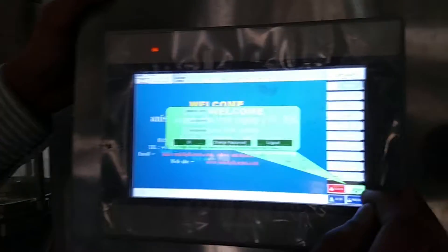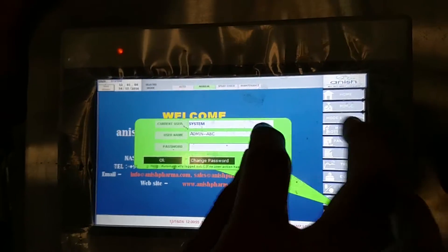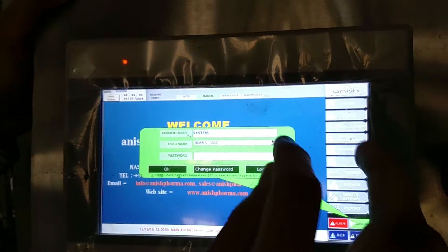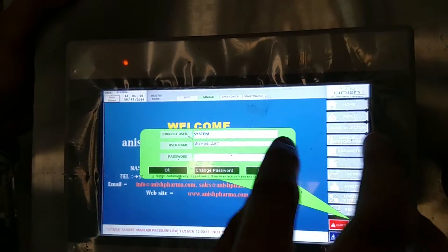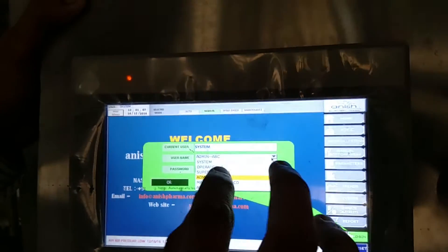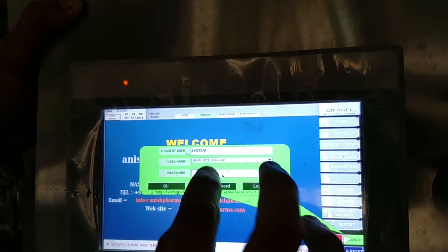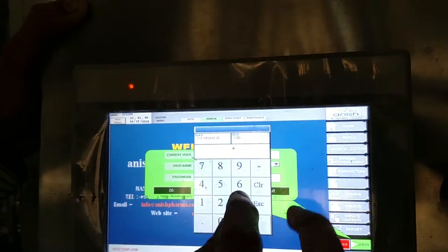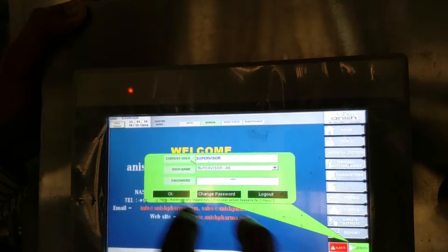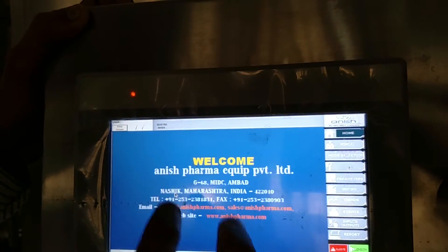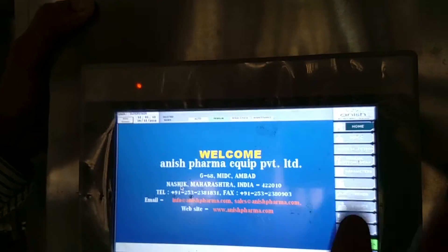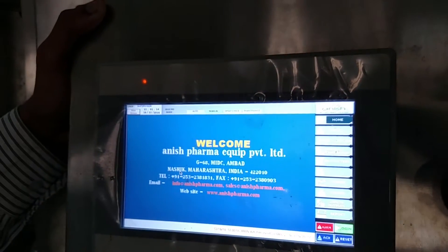Then you have to log in to this equipment. For login, it is provided to the supervisor. Then you will enter the password. Then it is now been logged in.